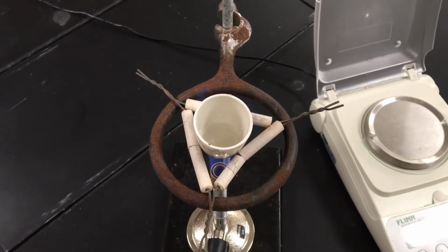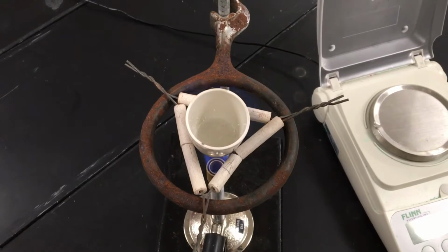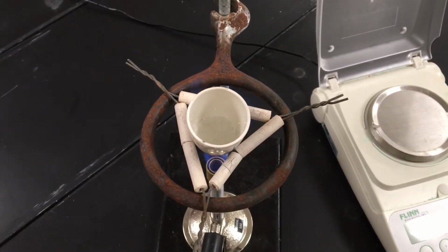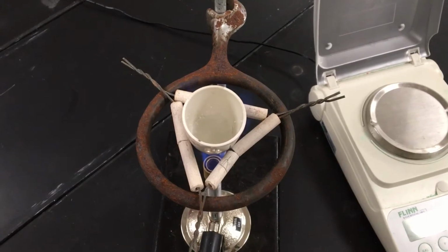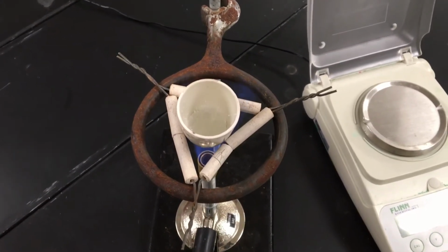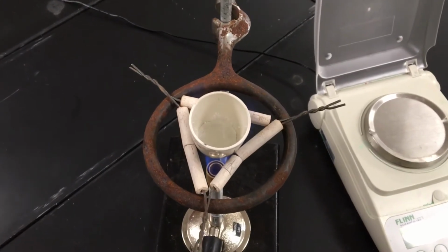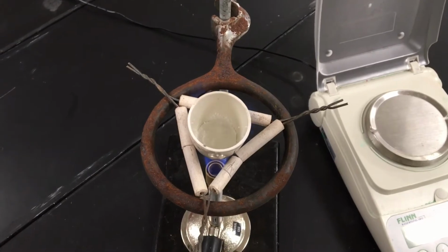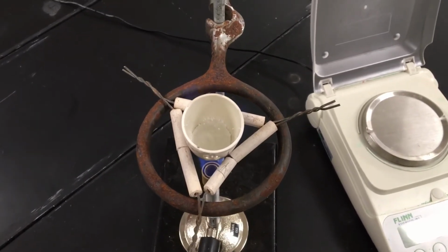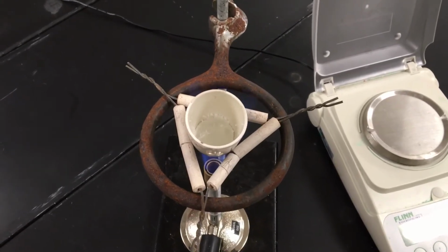Looking inside that crucible, what I can see is a very rigorously boiling sample. So this alum is a hydrated mineral, which means that it contains structural water. Your task is to determine the percentage of water, part of this alum, aluminum potassium sulfate, as well as determine the number of moles of water.